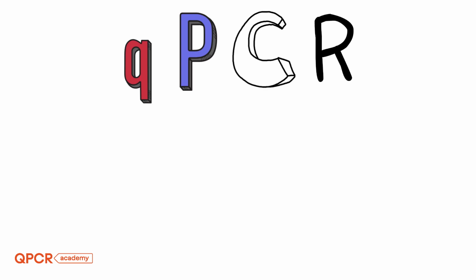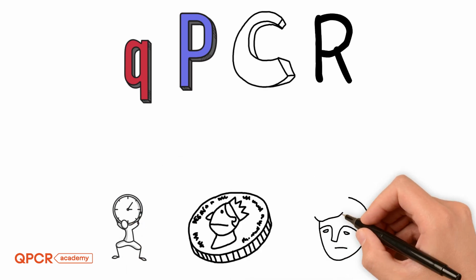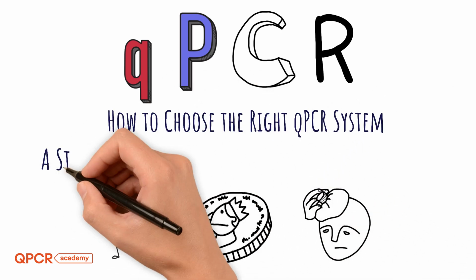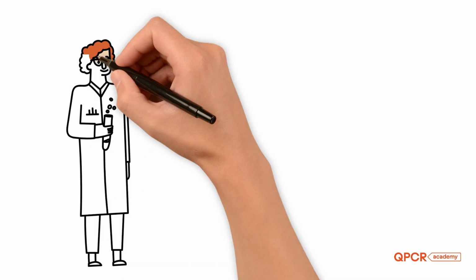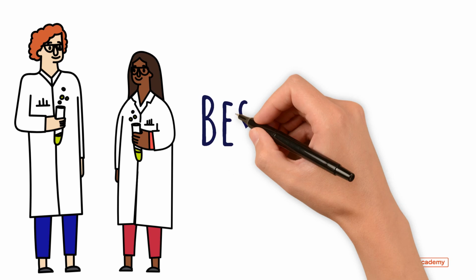The right qPCR system can save you time, money, and headaches. But how do you pick the best one? Welcome to this step-by-step guide on how to choose the right qPCR system for your lab. Whether you're a scientist or a lab manager, this video will give you practical tips to make the best decision.